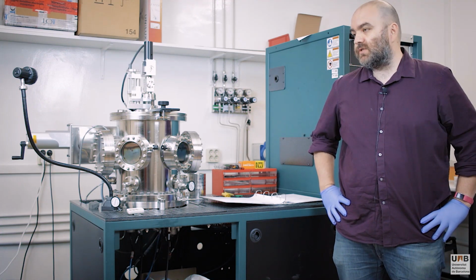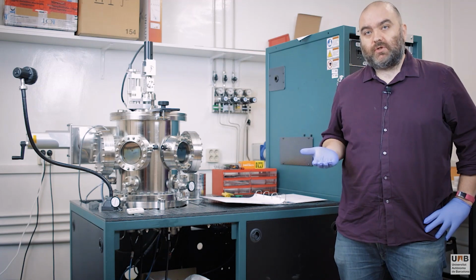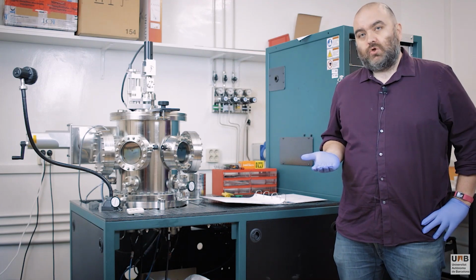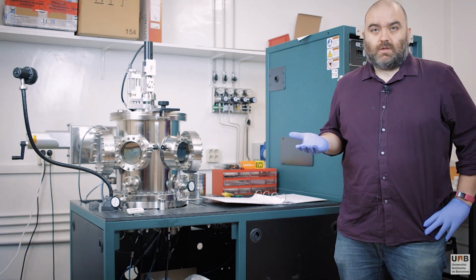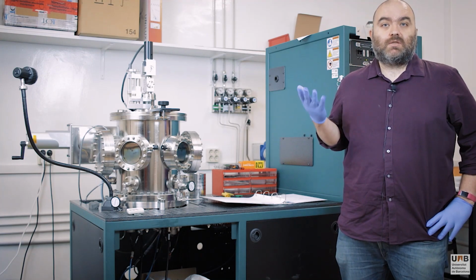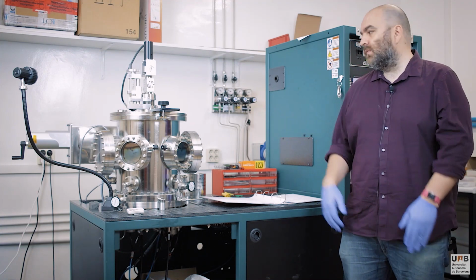how the process works. So, sputtering is basically the process where you choose a target material that you want to sputter, and then you bombard it with an inert gas, something like argon, and this material is then ejected from the target, kind of layers onto your substrate to form the film that you'd like to make.